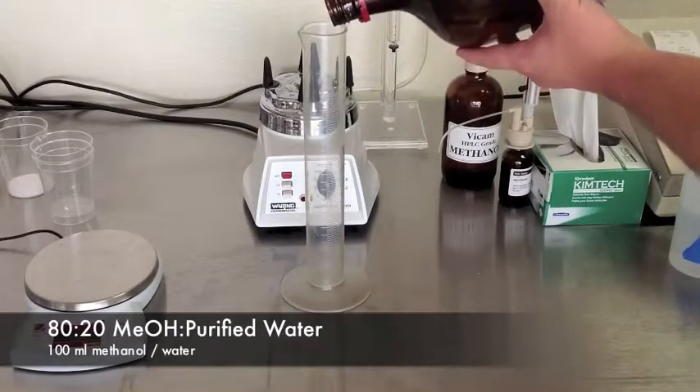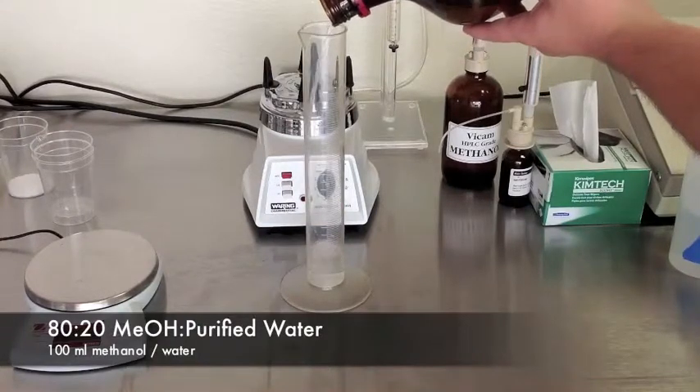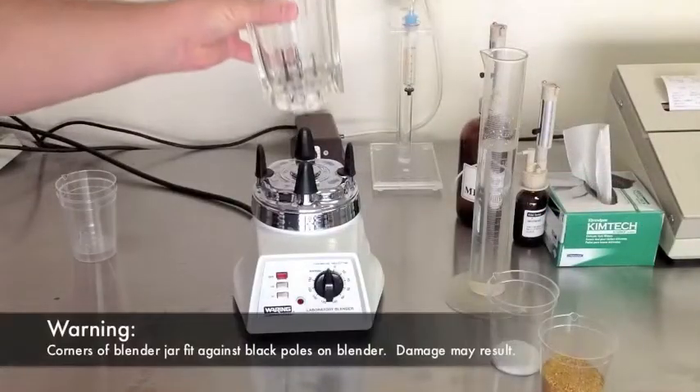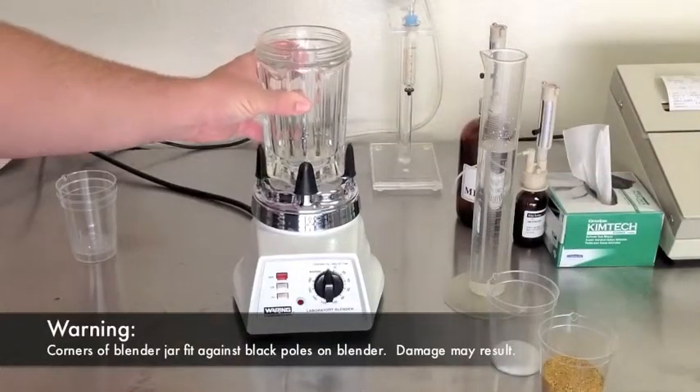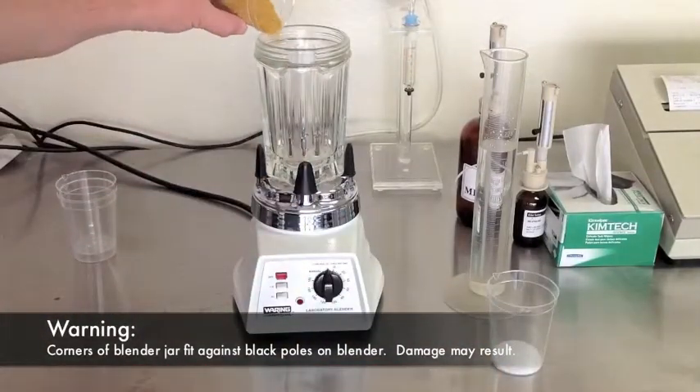This mix is available in a premix from Vicam. Add the sample, salt, and methanol to the blender jar. Set the timer just past 60 seconds and blend on high.